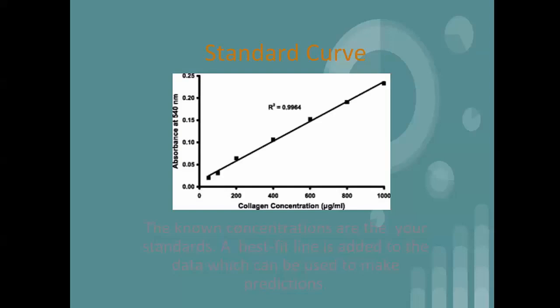One thing I want to point out is your assignment is going to be to make a scatterplot. I'd like you to do this on Excel. Please check out the videos on the lab website if you don't know how to do this yet. But you're going to make, this is obviously not the graph we'll be making, but it is a scatterplot, much like we'll be making. You'll insert a best fit line. You'll also tell it to insert the equation of the line. And this is what we call a standard curve.